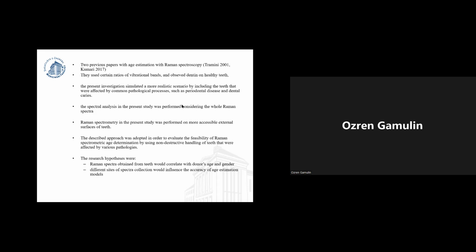The spectral analysis in the present study was performed considering the whole recorded Raman spectra. Raman spectroscopy is performed by accessing external surfaces of the teeth. The described approach was adopted to evaluate the feasibility of Raman spectroscopic age determination by using non-destructive handling of teeth that were affected by various pathologies.